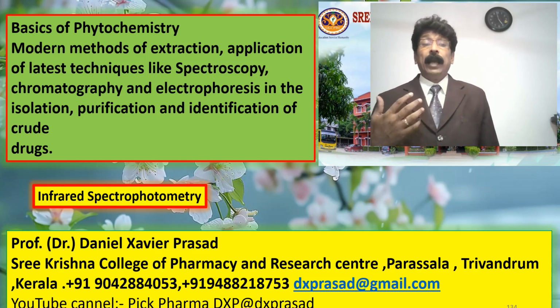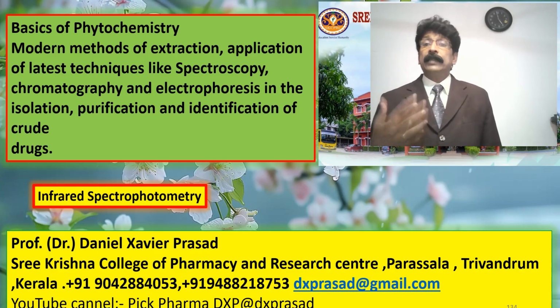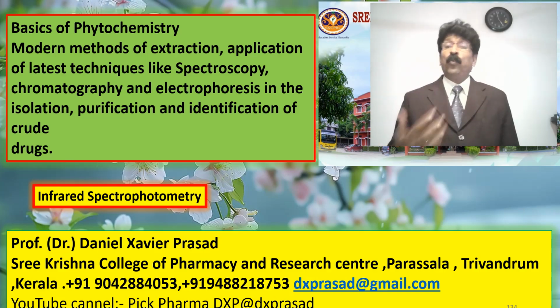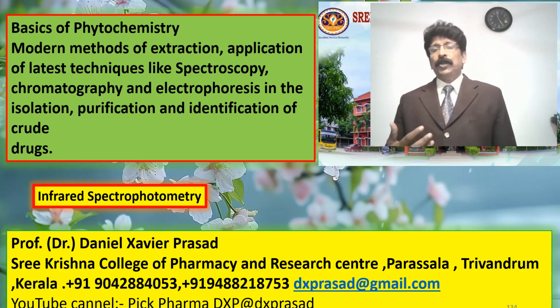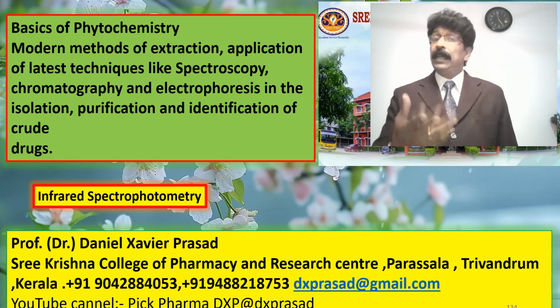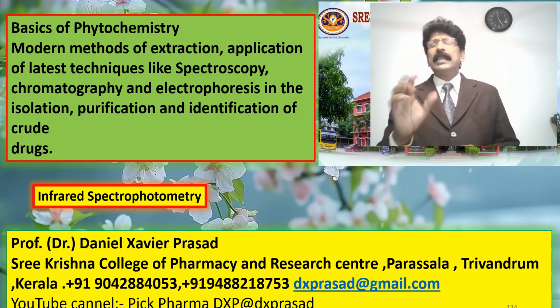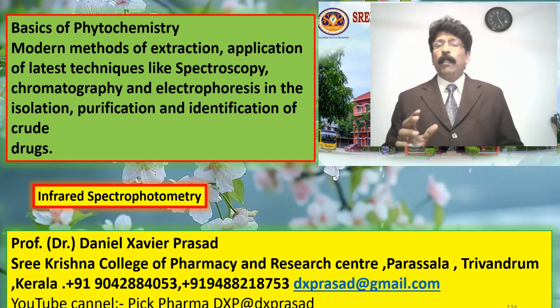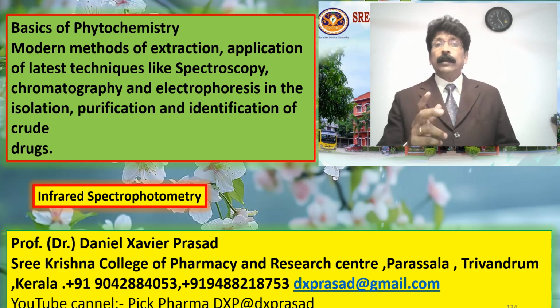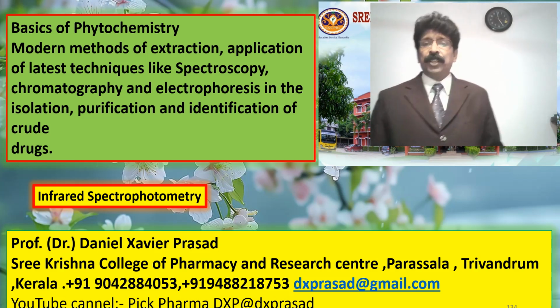by IR spectrophotometry. This is infrared spectrophotometry. So before going to the application, we should know the basic principle and basic instrumentation, basically how it is giving the band of the chromatogram and what is its relationship with identifying the functional groups.